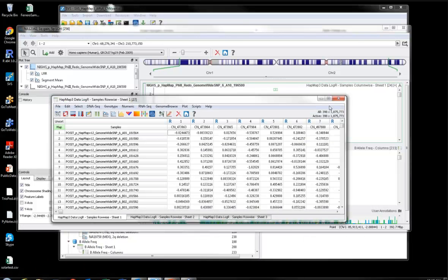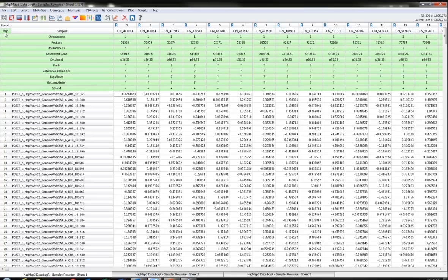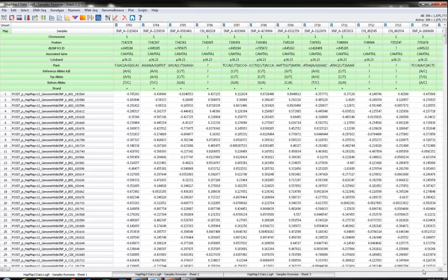Typically with CNV analysis, we expect that you are starting with either log ratio data coming from a SNP GWAS type chip or from an array CGH product like from Agilent or Nimblegen. And the raw data is going to look like this. Instead of having a big spreadsheet full of SNPs, of diallelic genotypes, here we have a spreadsheet with, again, rows per sample, but each column is capturing signal intensity at a particular position in the genome.